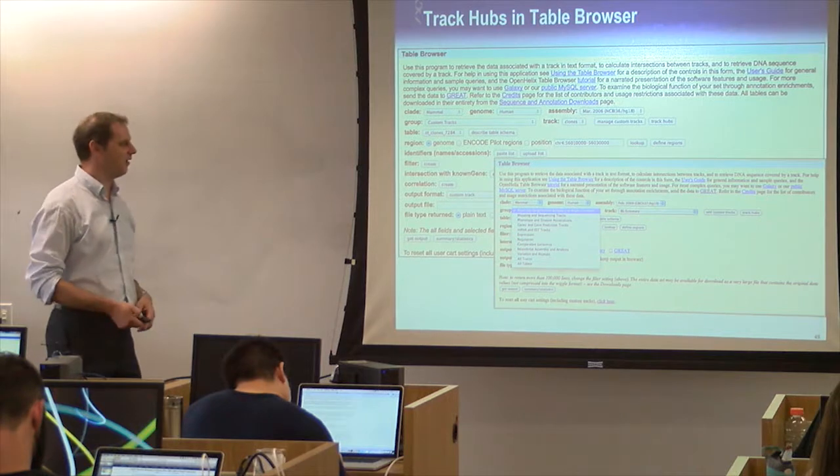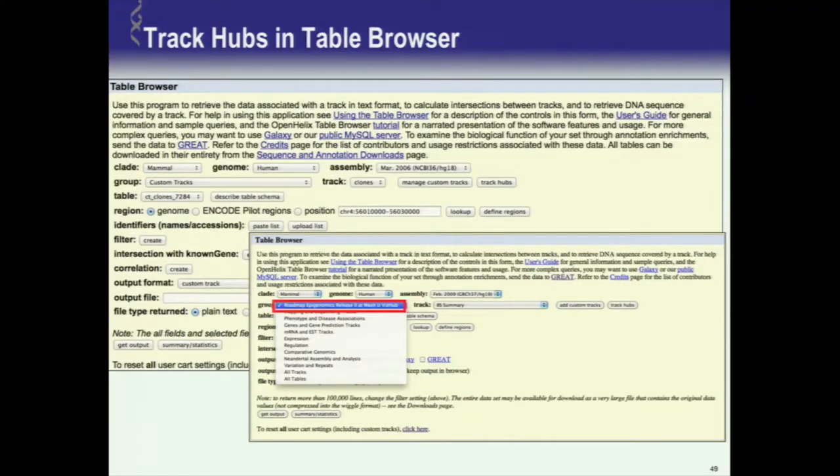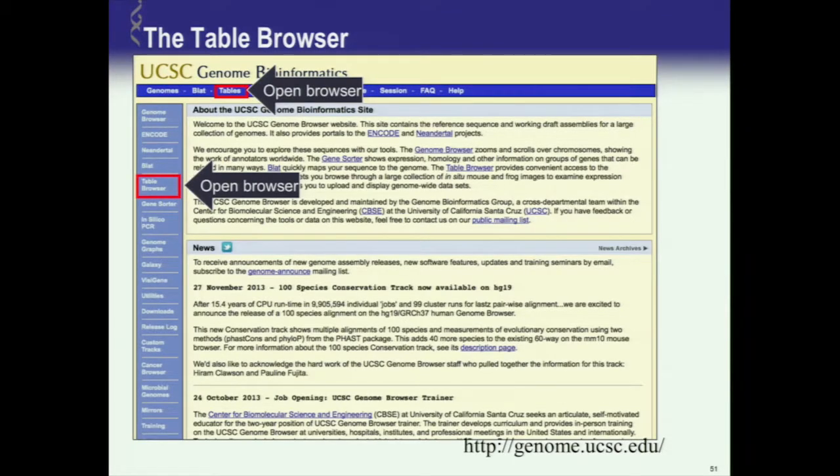So you could ask those kinds of bioinformatic questions: let me take other people's whole genome bisulfite sequencing data and start intersecting, and ask where are the regions where the methylation is low, high, whatever, that intersects with some gene that I might be interested in. I feel like I went through a lot of that really fast. I apologize. Probably confused everybody.